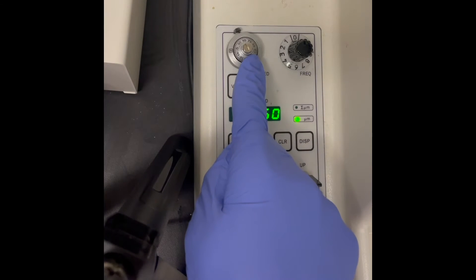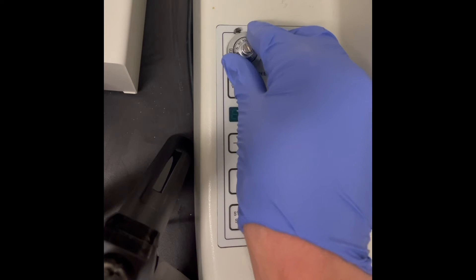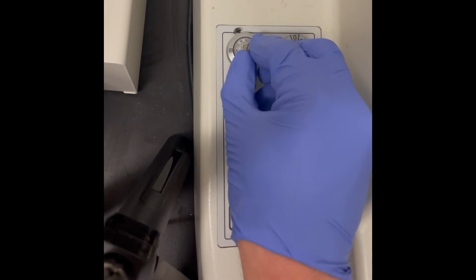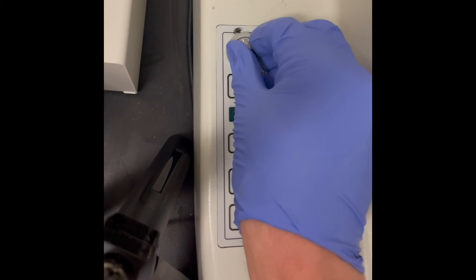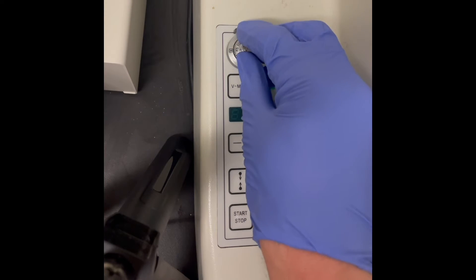To change the speed at which the blade advances, twist the knob in the top left corner, which has settings between 0 and 8. Optimal speed for sectioning is tissue dependent, but it is typically in the range of 2 to 5.